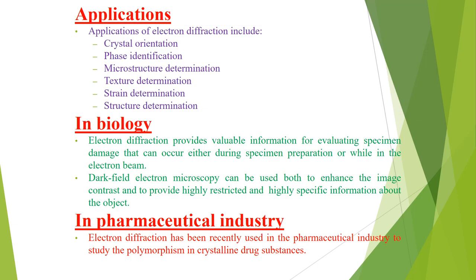The applications of electron diffraction include crystal orientation, phase identification, microstructure determination, texture determination, and strain determination. Structure determination is also one of its applications.